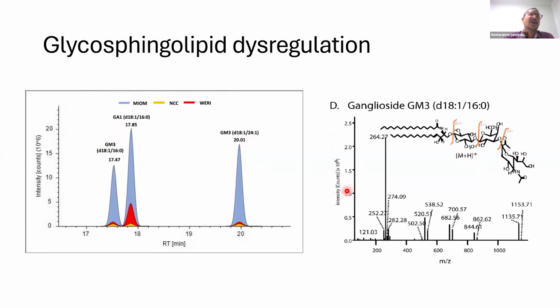As authentic compounds are very rare and very costly, we could do manual verification. As you can see, sialic acid is lost with 291 Daltons, and then one sugar loss and one more sugar loss. So there are at least 3 sugars and one is a sialic acid. So like that, we identified gangliosides, and GA1 does not have sialic acid. So all these 3 are downregulated.